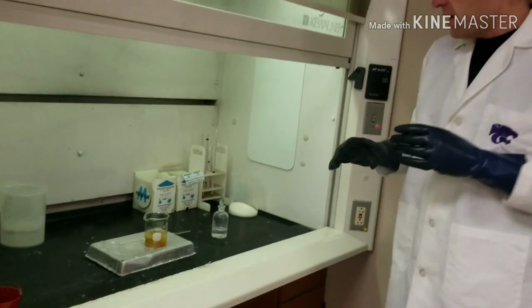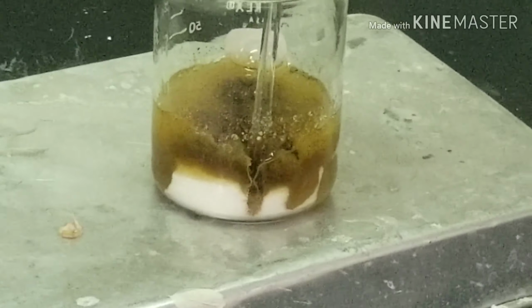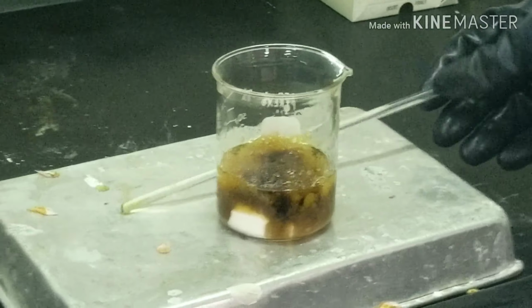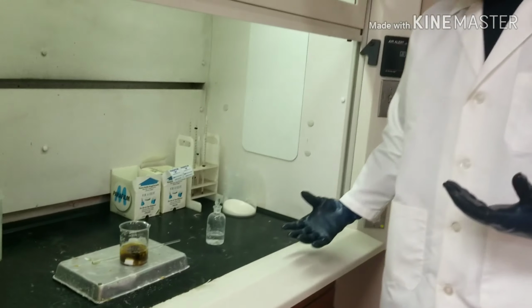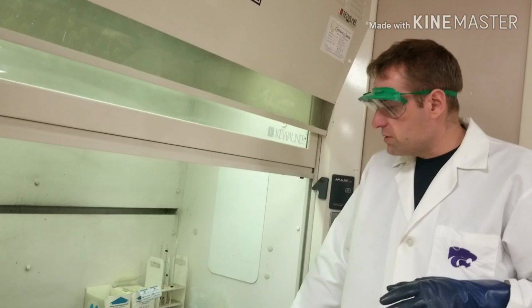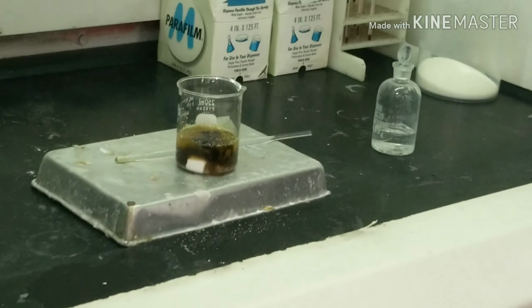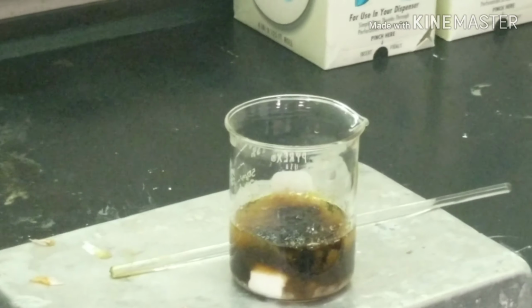This reaction takes a little bit to happen. As you can see, there's a little bit of color change going on here. We'll rotate this a little bit. I can actually mix this maybe a little bit more here. So there is color change going on. Heat's being created. As the reaction continues, the heat will build up, and the reaction will take place a little bit quicker. So now we wait just a little bit. There's probably a little bit of bubbles going on.